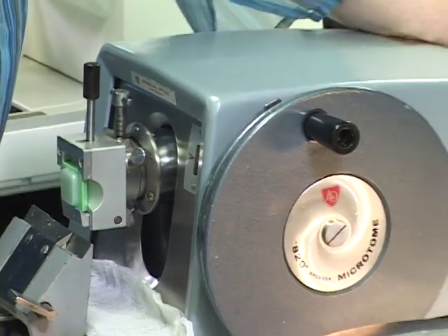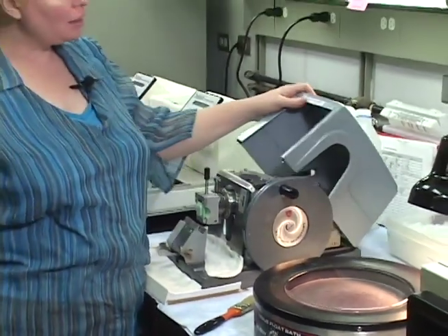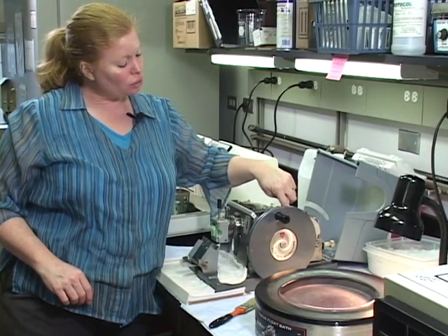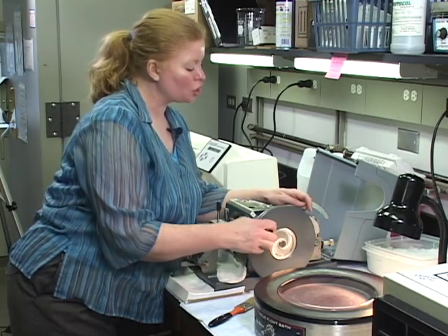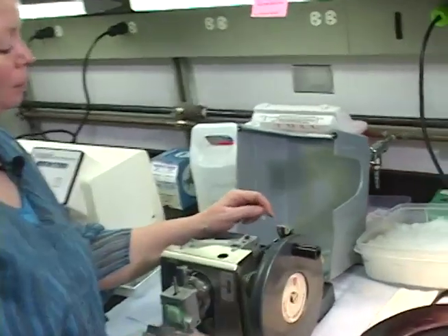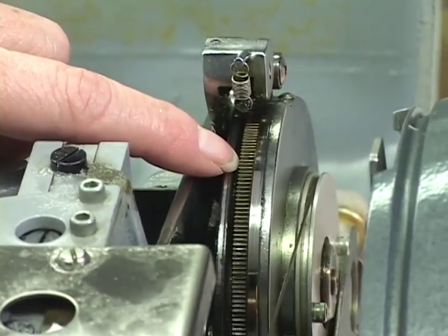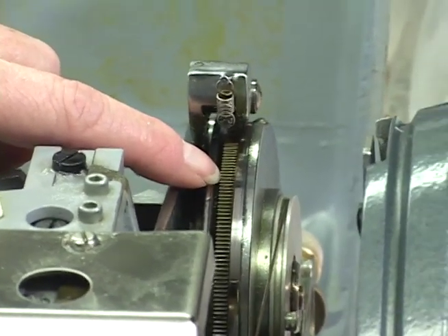For your own information, not that you will ever have to do this, but there's a kind of neat, nifty little way to tell that this is accurately cutting at the 3 microns. This actually has a little toothed blade, and as it rotates, the teeth push forward. Each tooth represents 1 micron. Here's the toothed wheel. Each tooth actually represents 1 micron, and over time and age, those teeth may have widened. I mean, this thing is probably a good 40 years old at least.